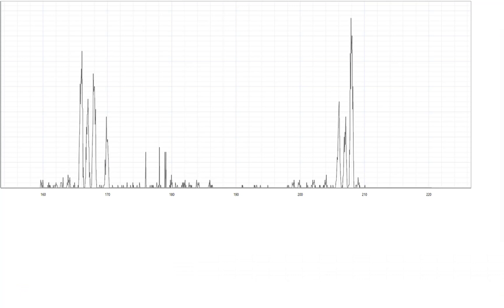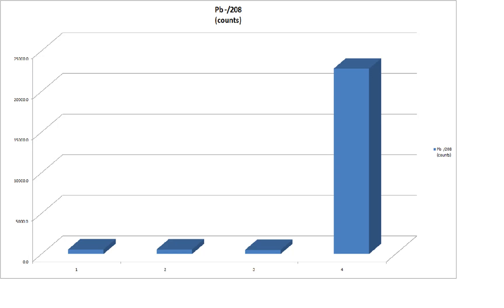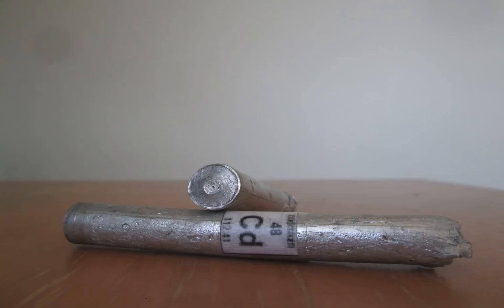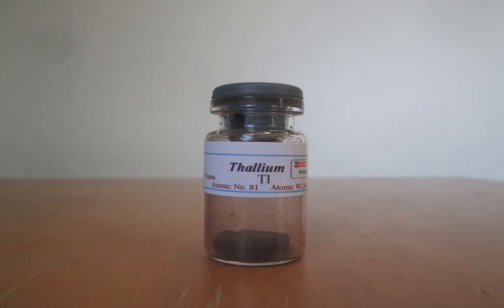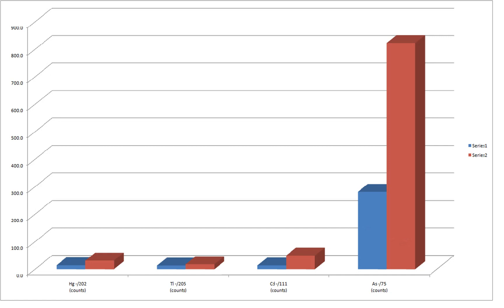Earlier I mentioned finding lead in pork, and since it's Thanksgiving, here's lead in turkey. I also looked at mercury, cadmium, thallium, and arsenic, and found some compared to the blank shown in blue here.